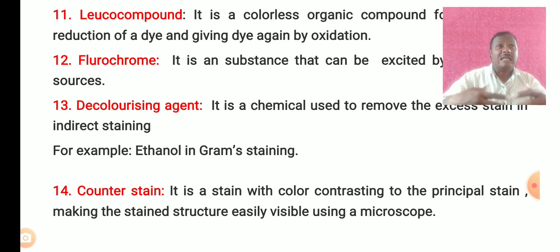Because for clear observation of microorganisms under the microscope, counter stains are generally used. Due to the use of this counter stain, we can clearly observe these microorganisms under the microscope. So friends, these are the different definitions of microbial staining techniques.